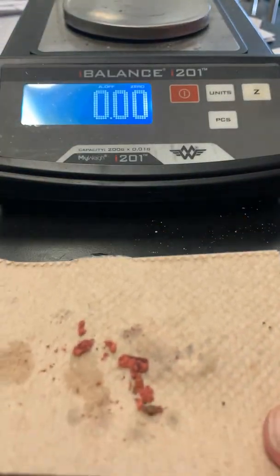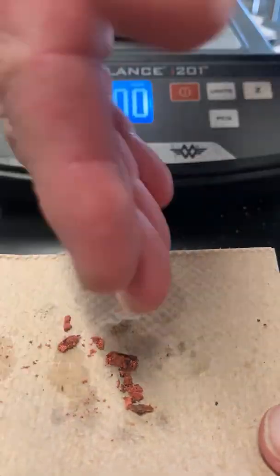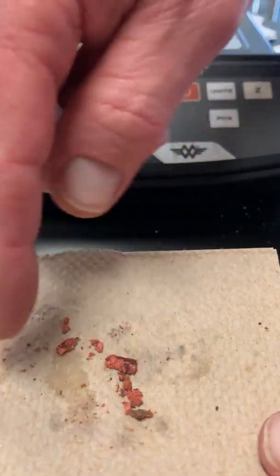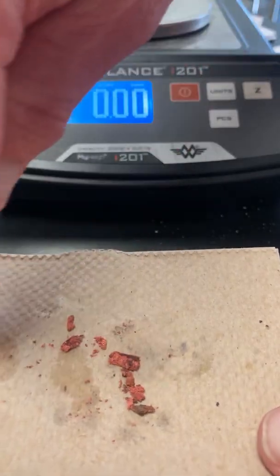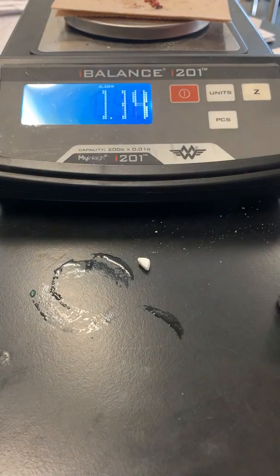So here's what the copper looks like that I scraped off, and I moved it off and let it dry. I probably could let a little bit more water disappear. You can see I have some wet spots here. And we weigh this. The original mass was 0.93, and the mass with the copper on it is 1.16.